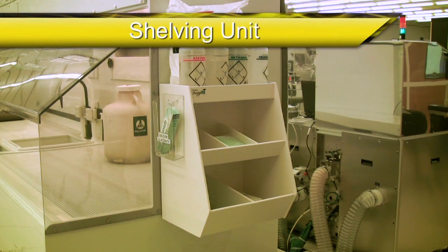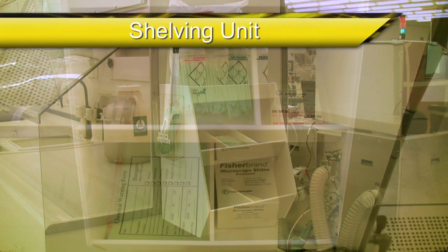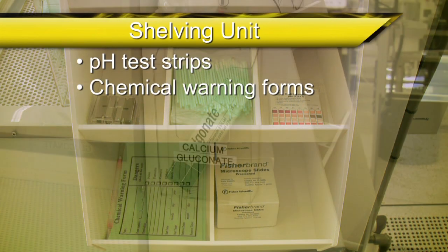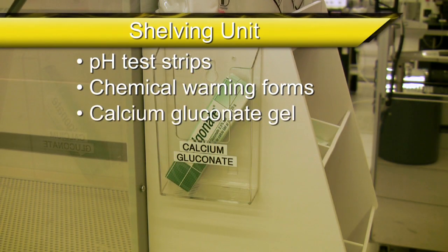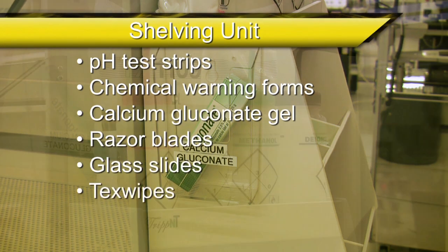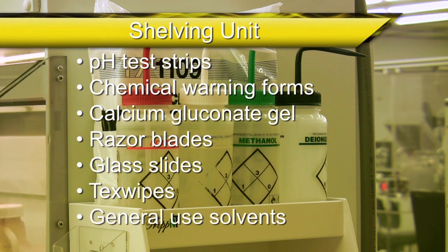Each of the wet benches in the clean room are equipped with small shelving units which hold items such as pH test strips, chemical warning forms, calcium gluconate gel, razor blades, glass slides, tech wipes, and general use solvents such as isopropanol, methanol, and acetone.